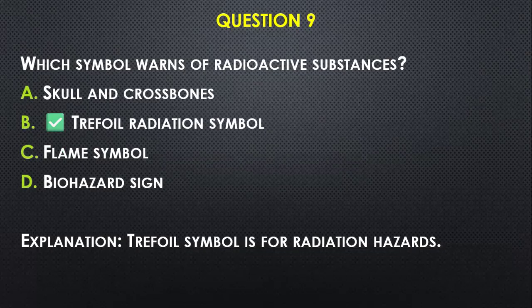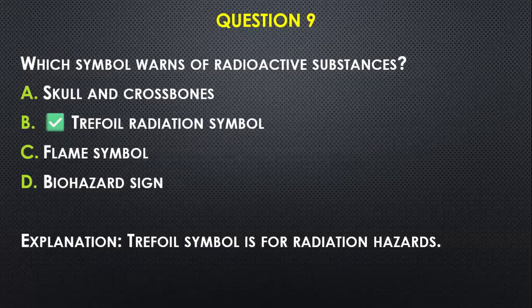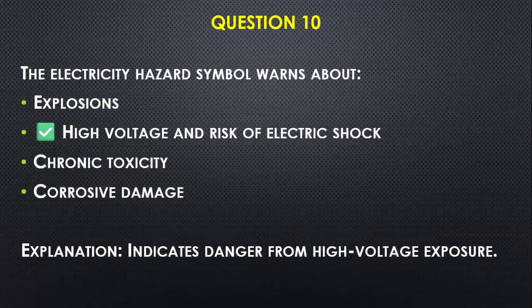Question number nine: Which symbol warns of radioactive substances? A) skull and crossbones — that's acute toxicity, B) the trefoil radiation symbol, C) flame symbol, D) biohazard symbol. I will go with the trefoil radiation symbol; you always see it anywhere you have radioactive substances or X-rays.